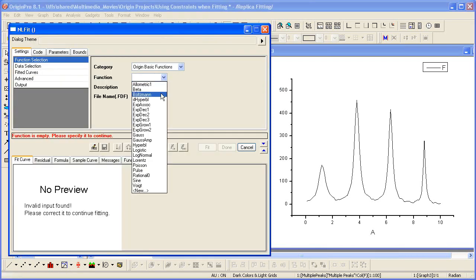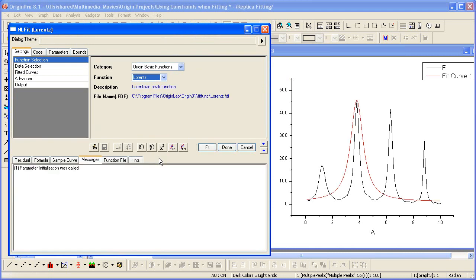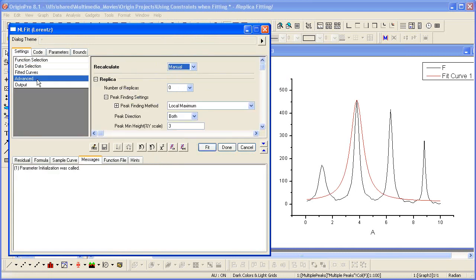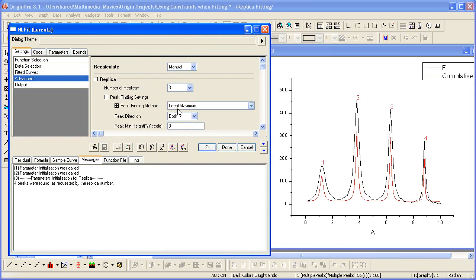This time for the function, I'm going to choose Lorentz. Now I need to go to the advanced settings and set the number of replicas, which is the number of peaks minus 1. So we set this to 3.